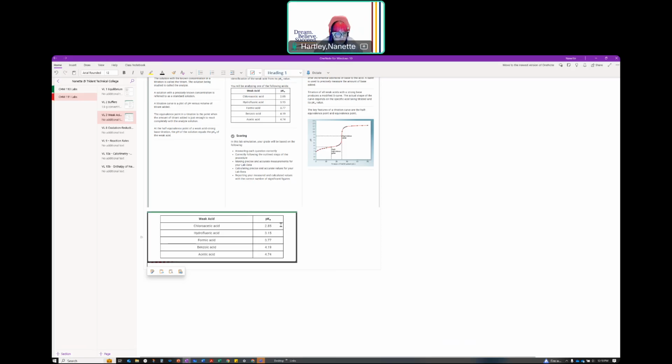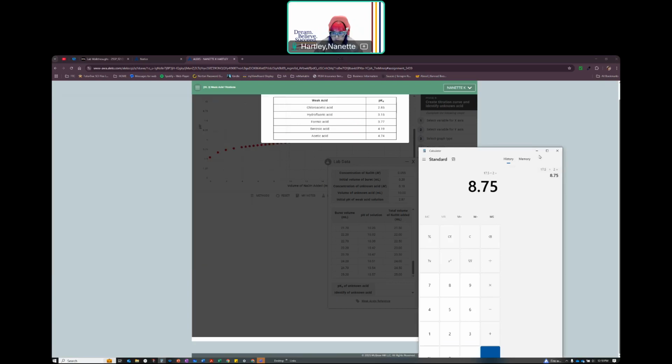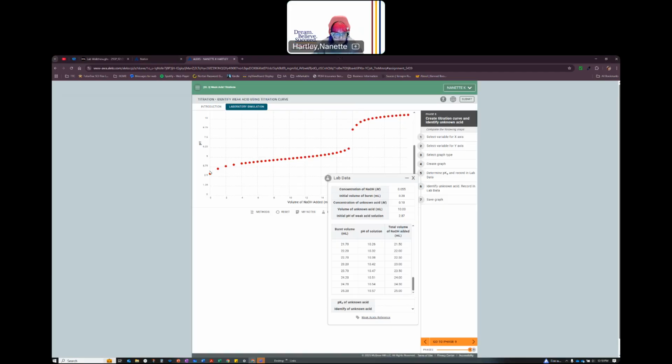And what I see is that I've got chloroacetic acid at 2.85, hydrofluoric at 3.15, formic at 3.77, benzoic at 4.19, and acetic at 4.74. And again, looking at where I'm at, roughly here, we're closer to 5 than anything else. So I'm going to say it's 4.75, and therefore, it's acetic.